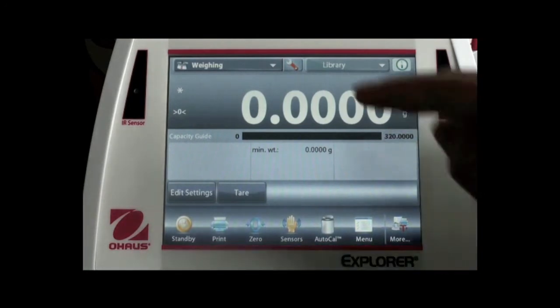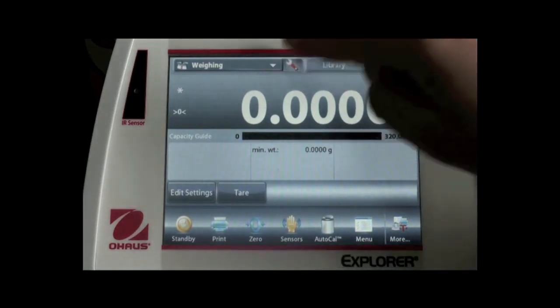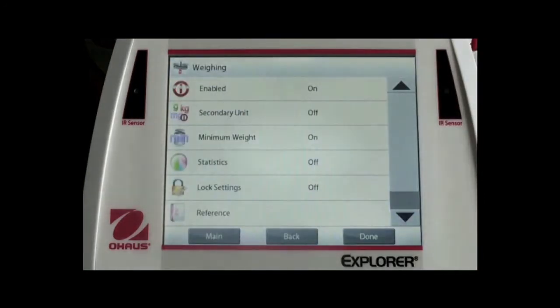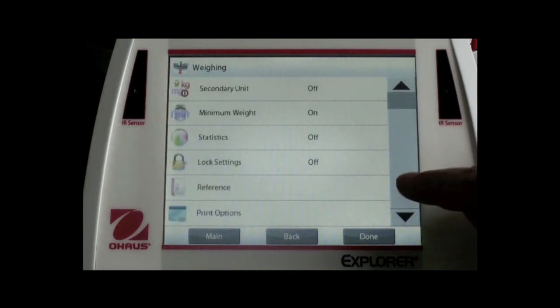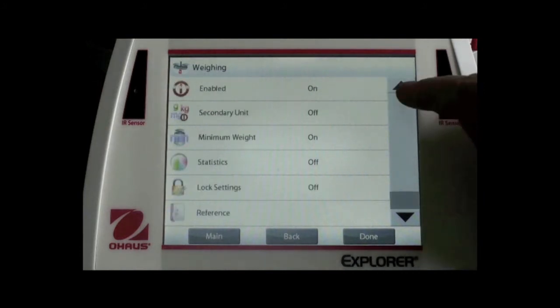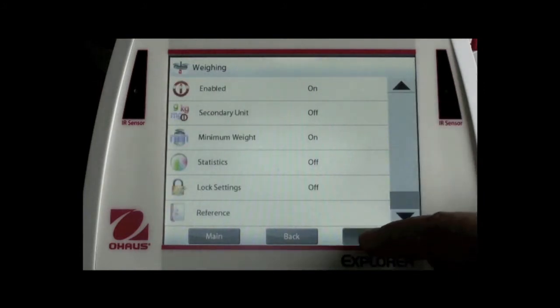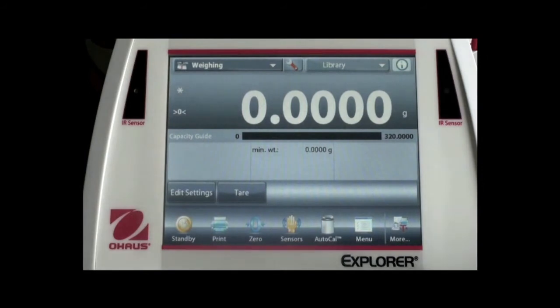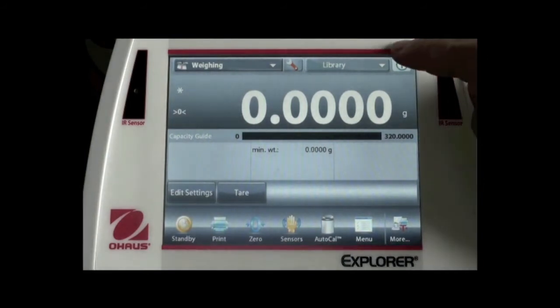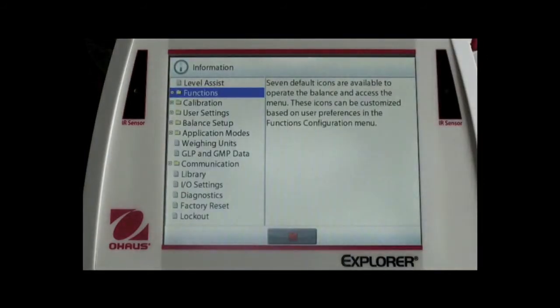The second button is the tool button. Here you can set up the weighing mode. The third button is the information button. Here you can get help on how to use the various features of Explorer.